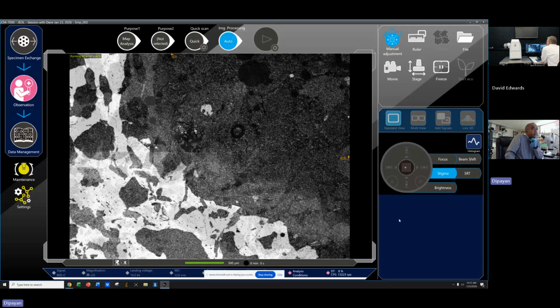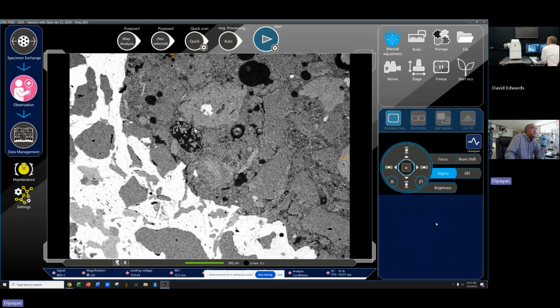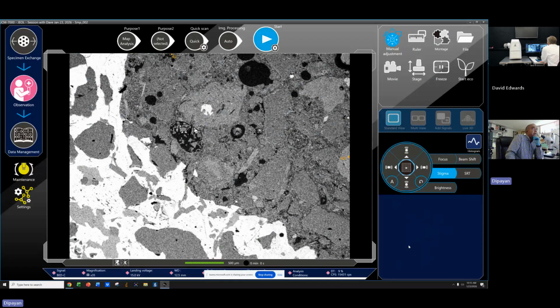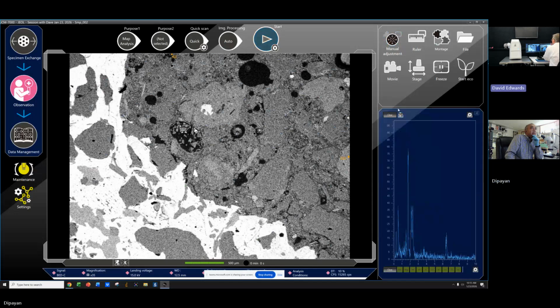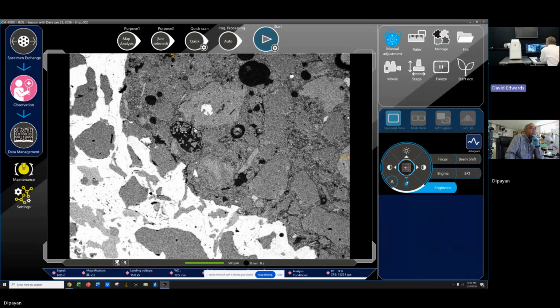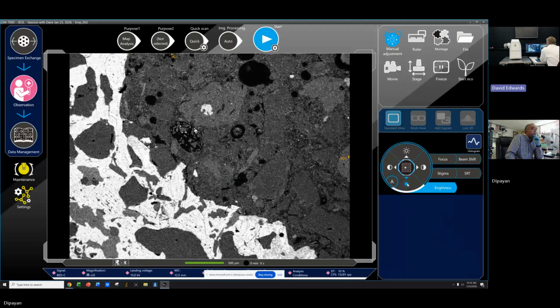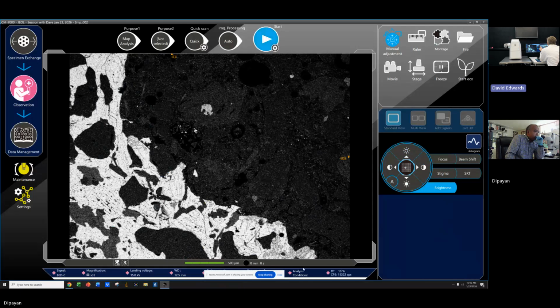For a while, if I don't get this live analysis screen active at all, I just get all blank there. So once we shut down the SEM and restart, not the PC, just the SEM, then we bring the live screen back. Now, at the bottom of your screen, in the lower right corner, there's a little up arrow. Not the SEM screen, your PC screen.